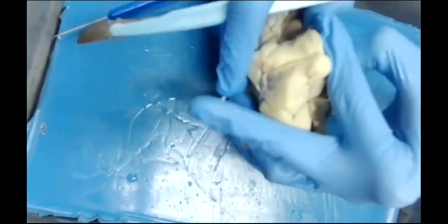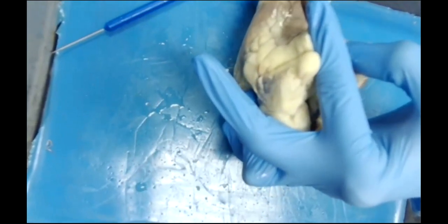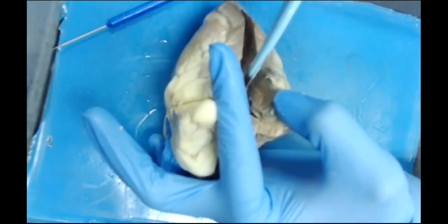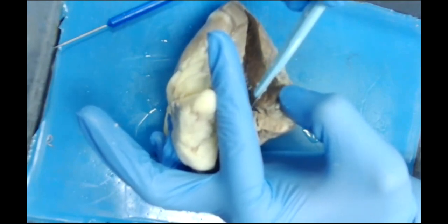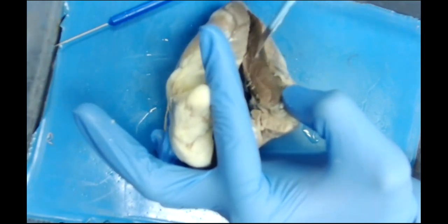It can be tough to get through, especially this left side because of all of that muscle. So y'all can see what I'm looking at here, where you can see all of this connective tissue. So we have all of these muscle fibers. You can also see that I'm cutting right now through one of the valves, and I'm trying to do so as cleanly as I can.